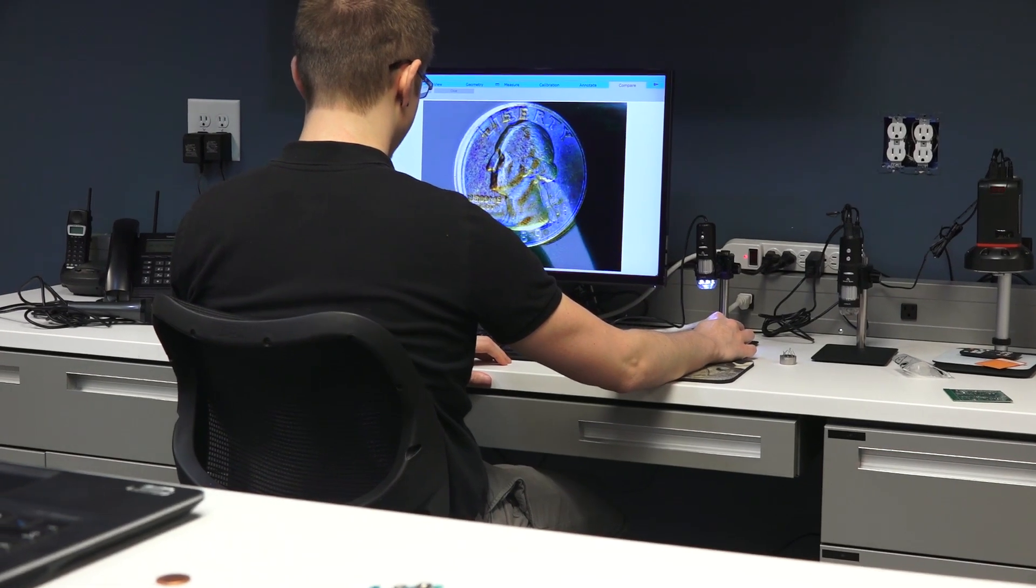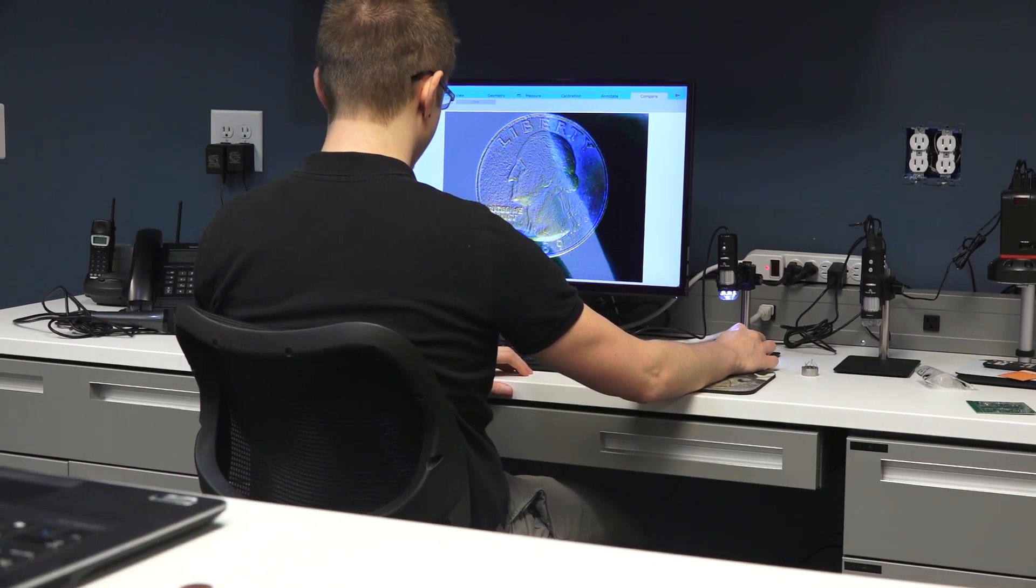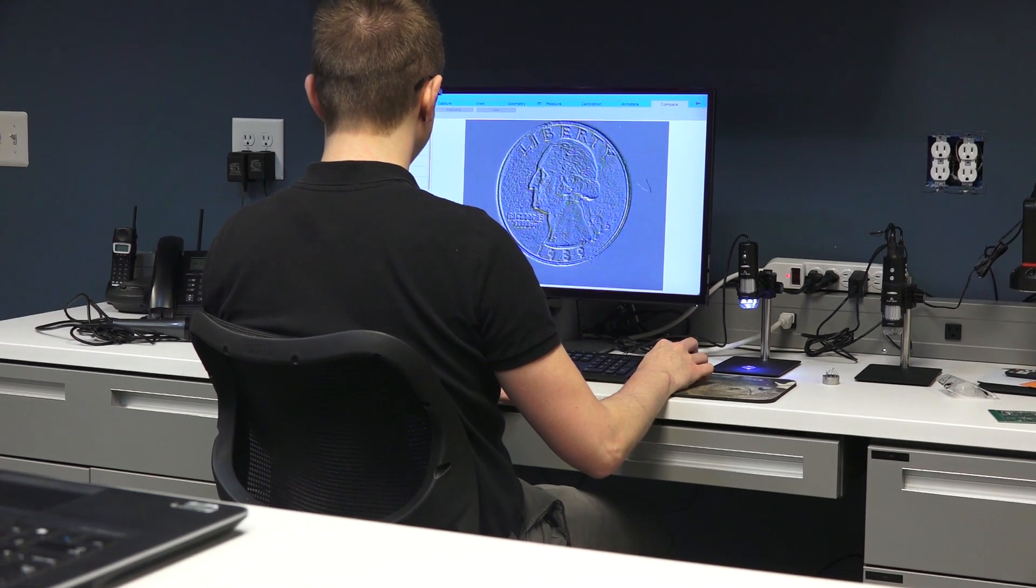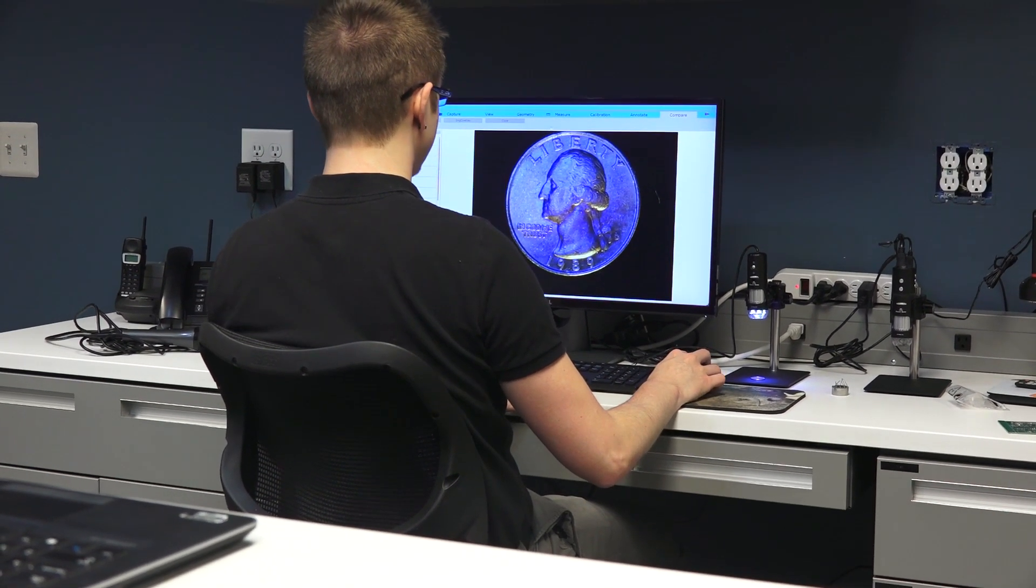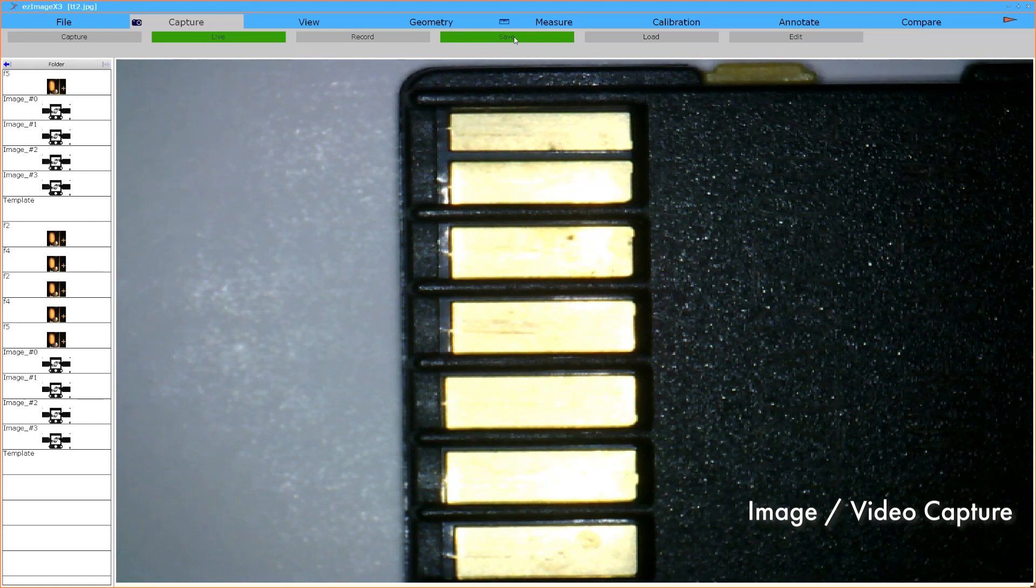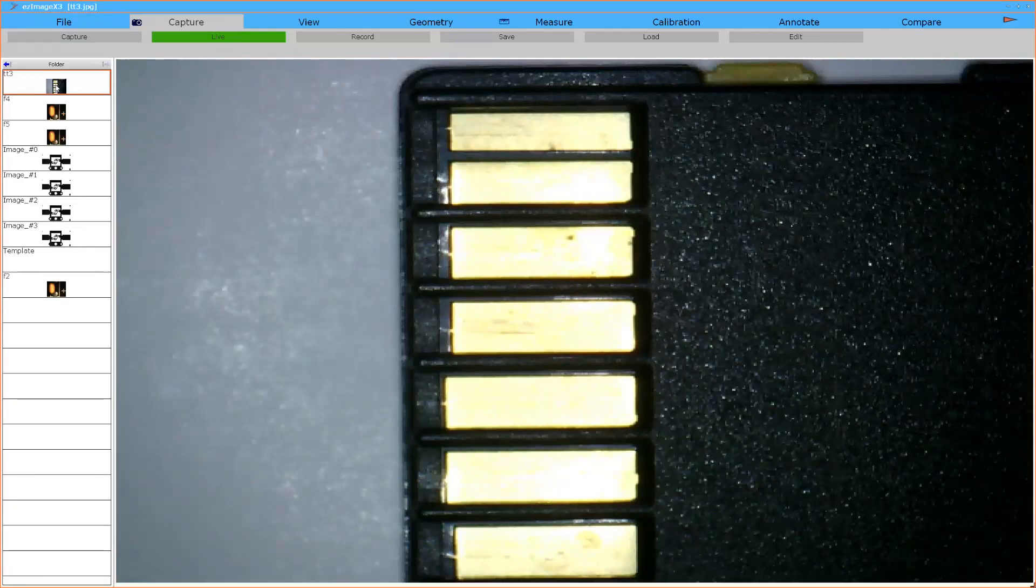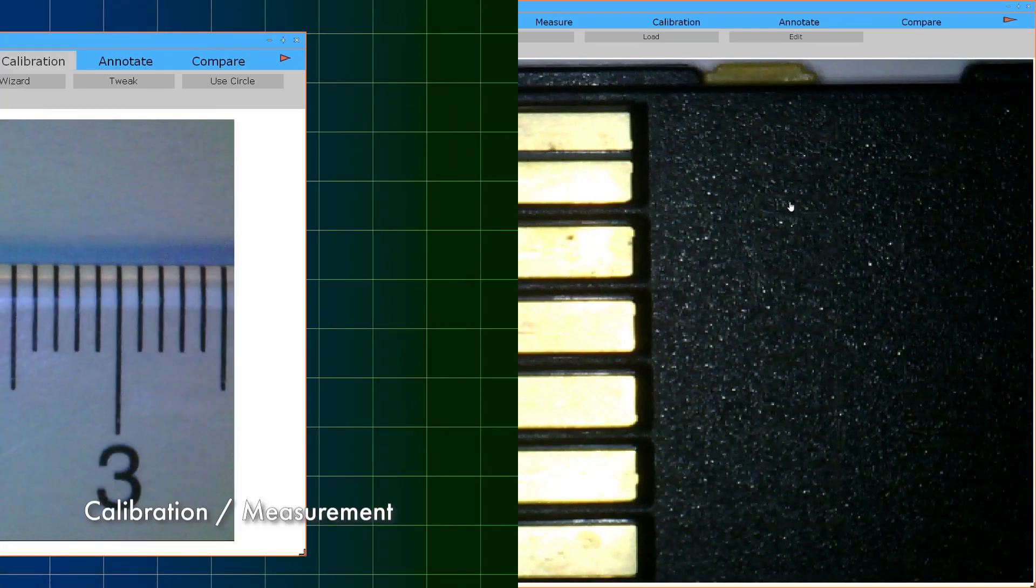Easy Image X3 contains all of the features operators have come to expect from imaging and measurement software, including image and video capture. Easy Image X3 captures high-resolution files to your computer. These files can be viewed within the software itself or within other imaging software programs.